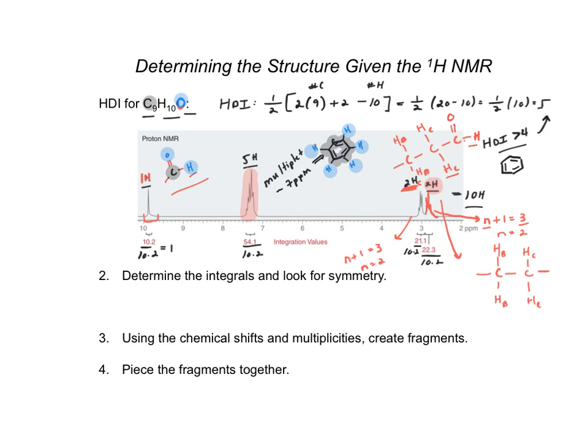And then HB, on the other hand, would probably be the thing that's attached to the aromatic ring, right? Because being near a carbonyl would shift it about 2, 1, I don't know. I forget what there's a little. I'm going to have to go back and look at that. Hold on just a second. Yeah, so I think HC is the farther one downfield.